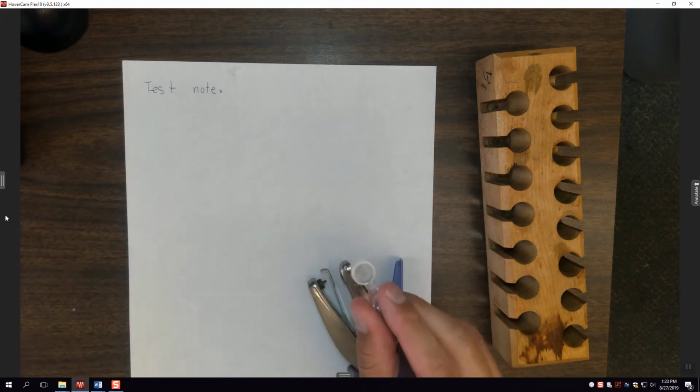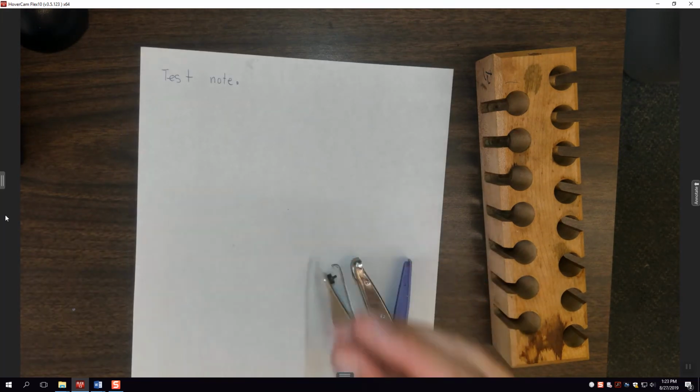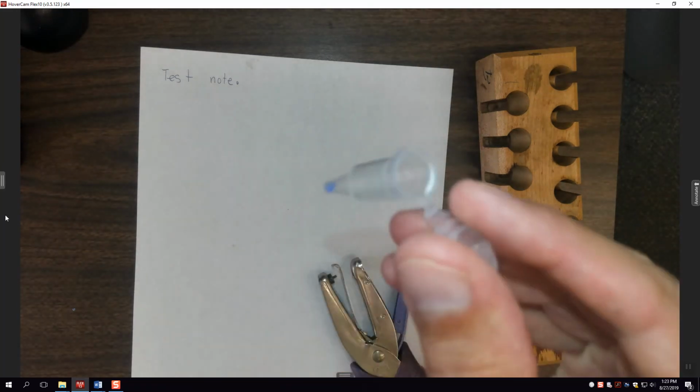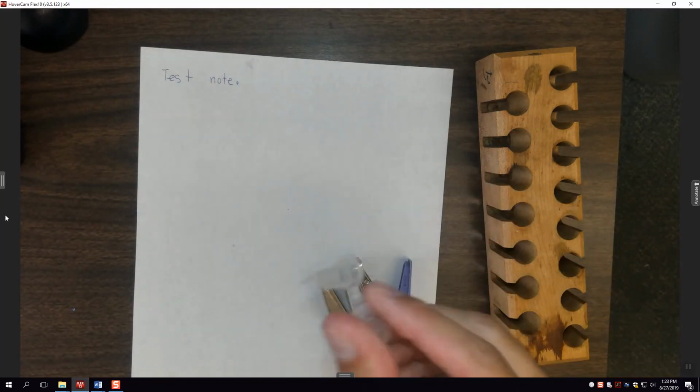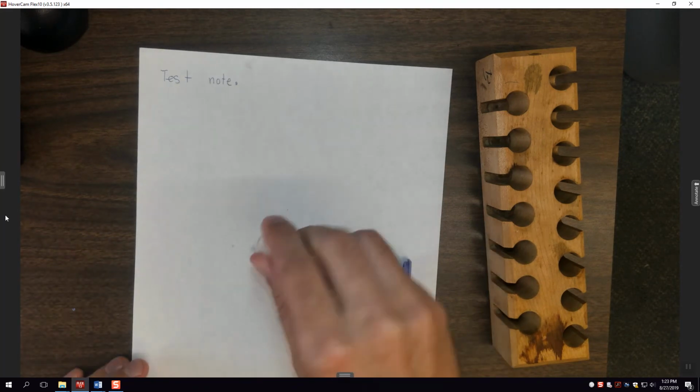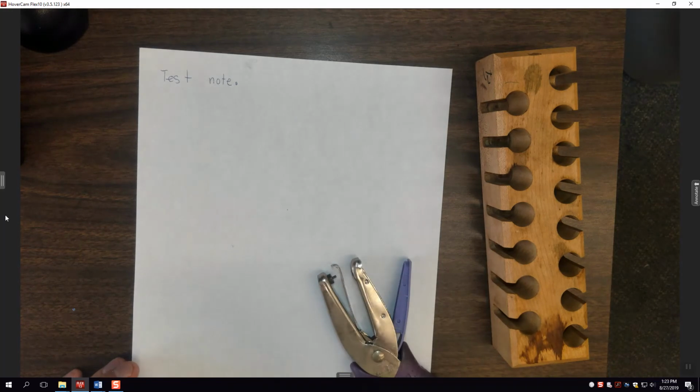All right, and I didn't do all 20 or 30, but maybe you can see there are some in there. Okay, so now I have some in there. Now what I'm going to do is add 1 or 2 drops of pyridine. I'm going to close this, gently shake it around, and let it sit for 10 or 15 minutes.